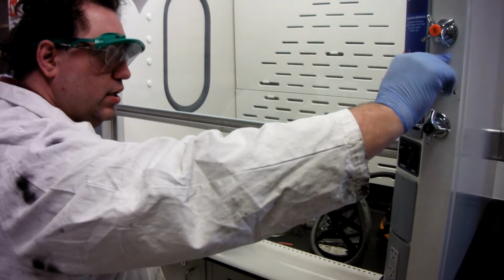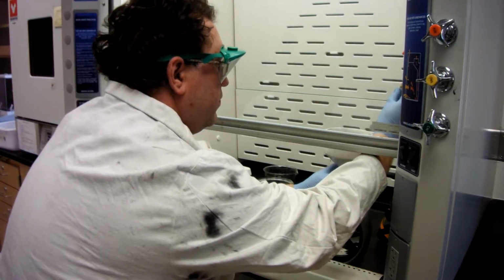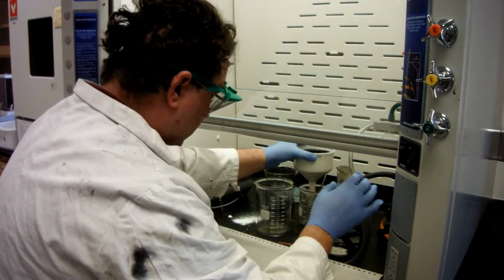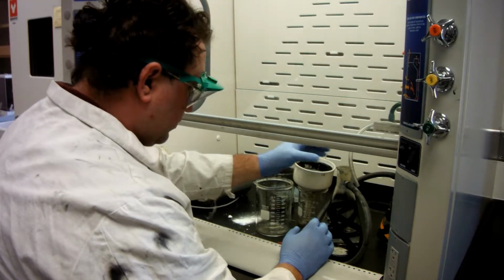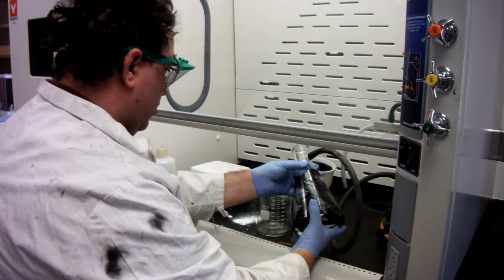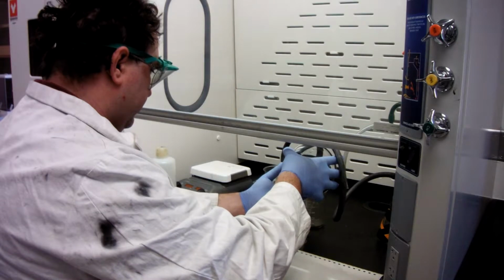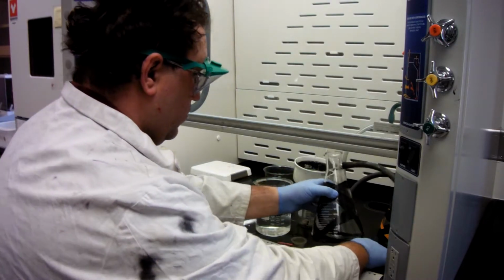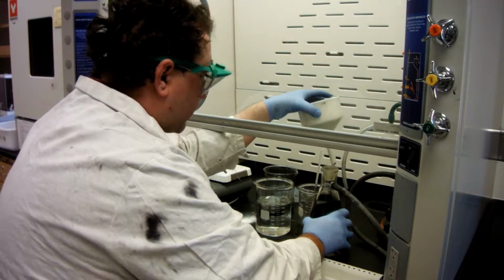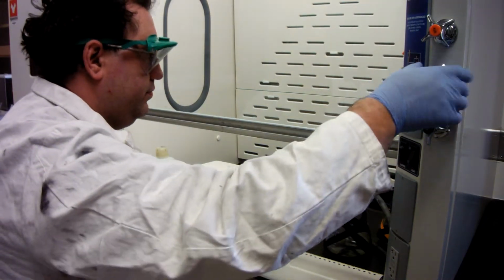Here, we turn off the vacuum, we release our vacuum, and we take this and place this in our beaker there. We then take the rubber grommet off, and we can then pour our fluid into the waste beaker. We then put our rubber grommet back on. We can put our filter back in and turn on our vacuum again.